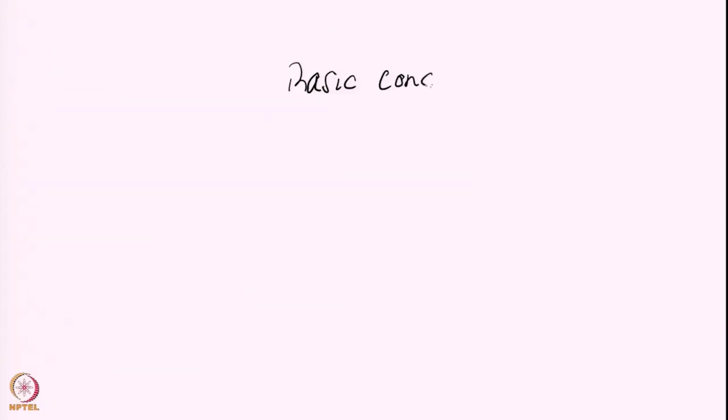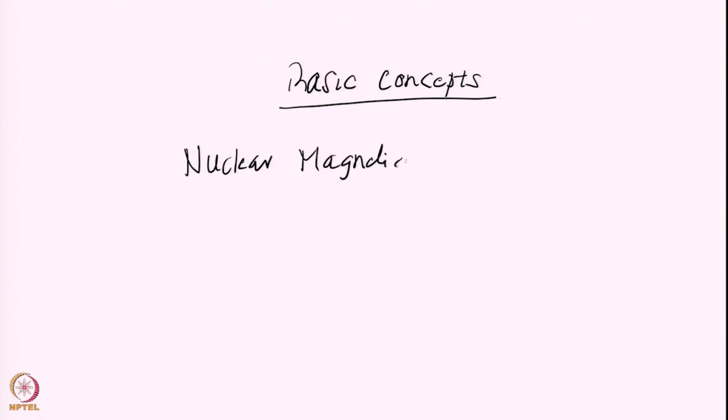Okay. So, let us start with the basic concepts. So, we will start here. And what does NMR stand for? NMR stands for nuclear magnetic resonance.